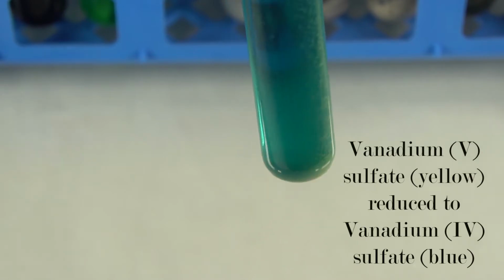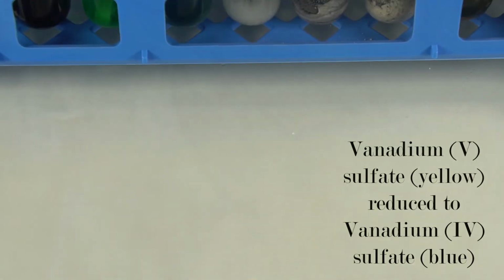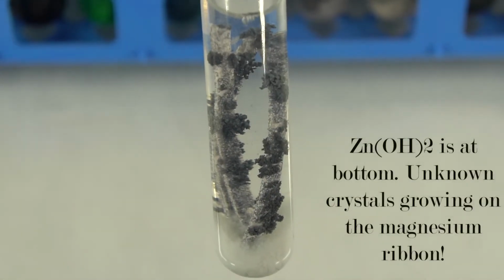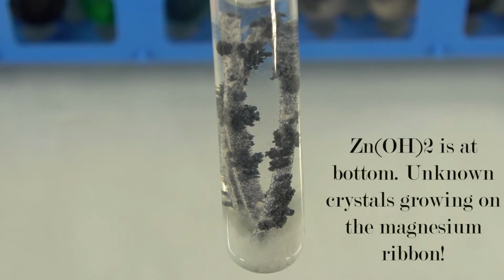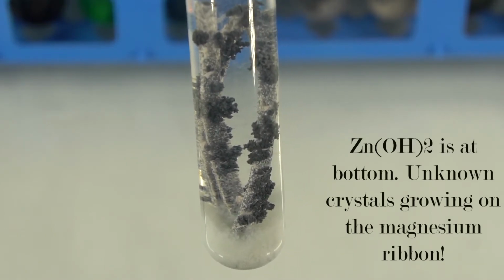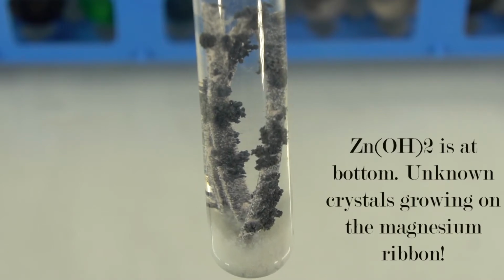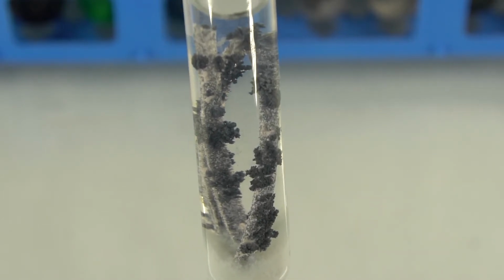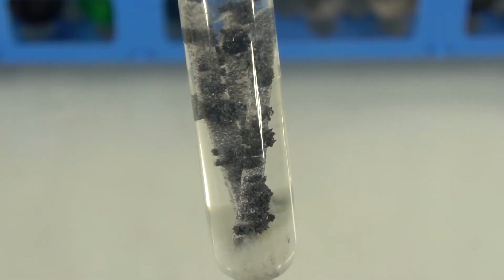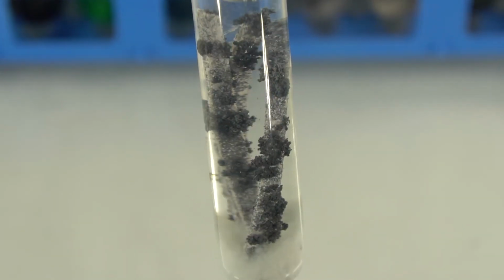Vanadium sulfate gave the most vigorous and dramatic reaction, and it almost bubbled out of the test tube. There was a dramatic color change from yellow to teal blue as vanadium was reduced from +5 to +4. Zinc produced gelatinous zinc hydroxide, but also beautiful crystals of some element or compound on the magnesium ribbon. We need to confirm if it is elemental zinc, but they do look gorgeous.